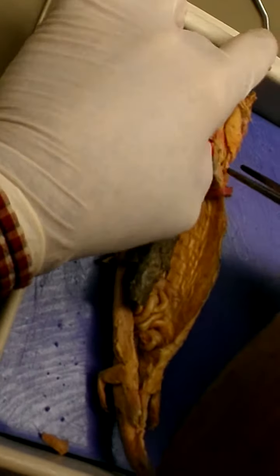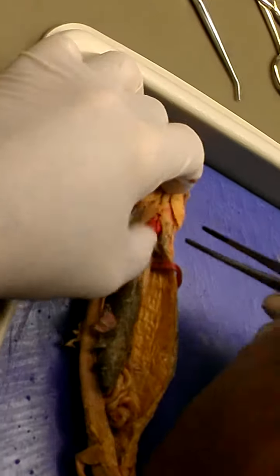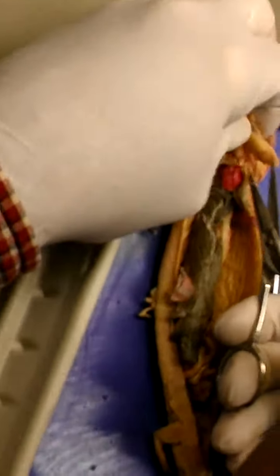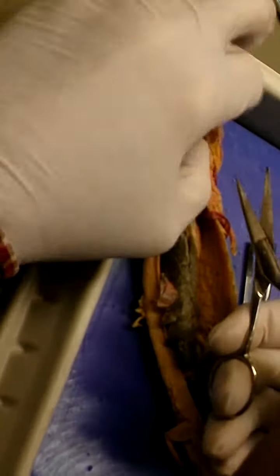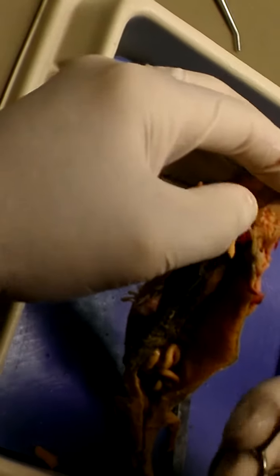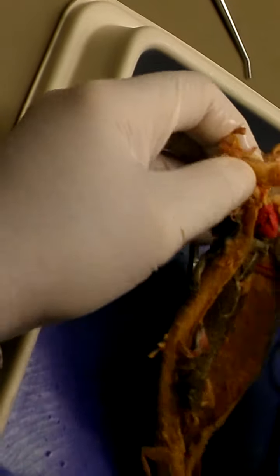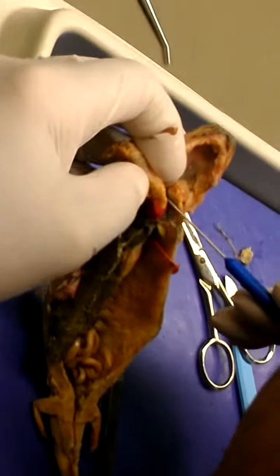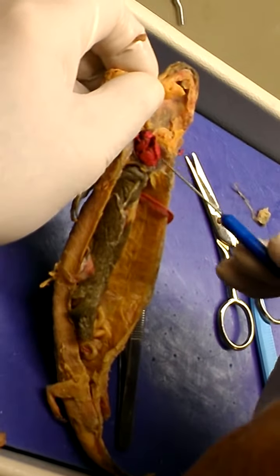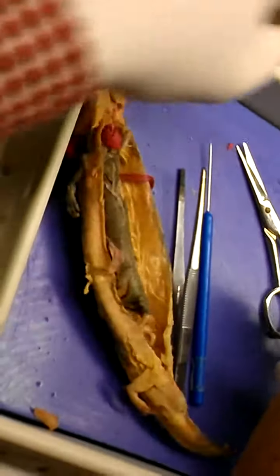Okay. Then up on the front end of the animal, up here, what I want to do is, I'm not sure how this is going to come out because you never know. I'm going to actually cut this right across the actual jaw. I'm going to purposely cut the jaw here so that I can open this back and start to take out the heart. Okay. Now, when you look at the heart, what you should see is that you have, in this case, this is not bad. This is a blowout here. This little flap right here is a blowout.